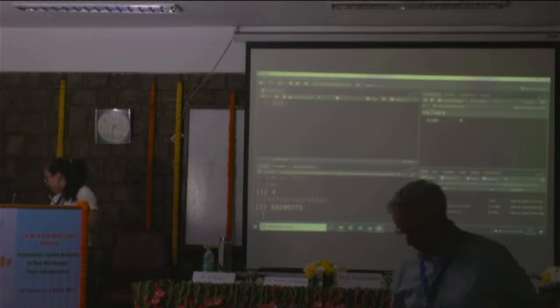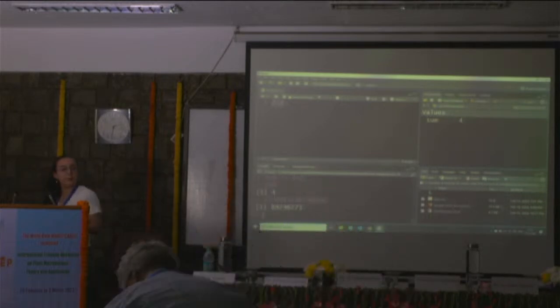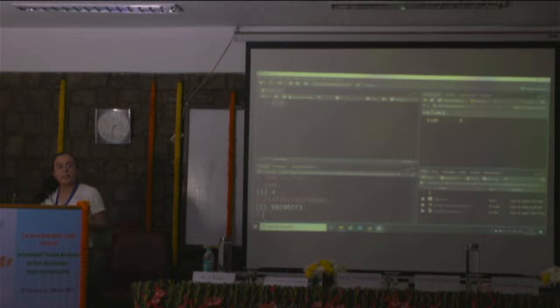Then, this is the last panel that we have to explain now. So first we have the files. Everything that you are running in RStudio is happening somewhere in your computer. And in that panel, you can see which files you have saved in the folder where you're running RStudio. Where can you see this folder? In here. This very long line that I have here is the folder where I am running it.